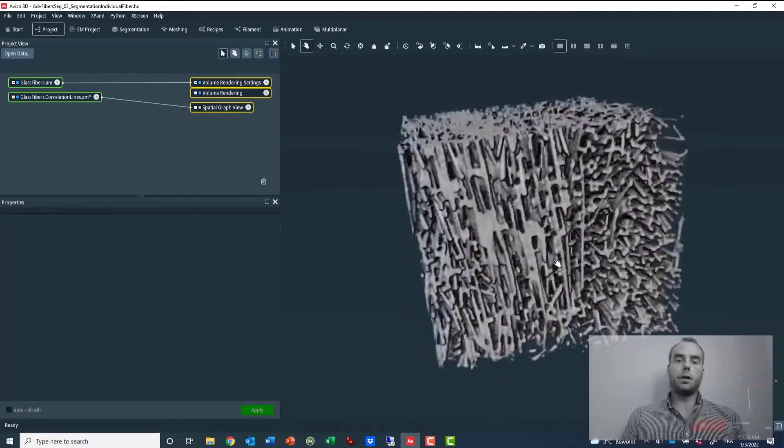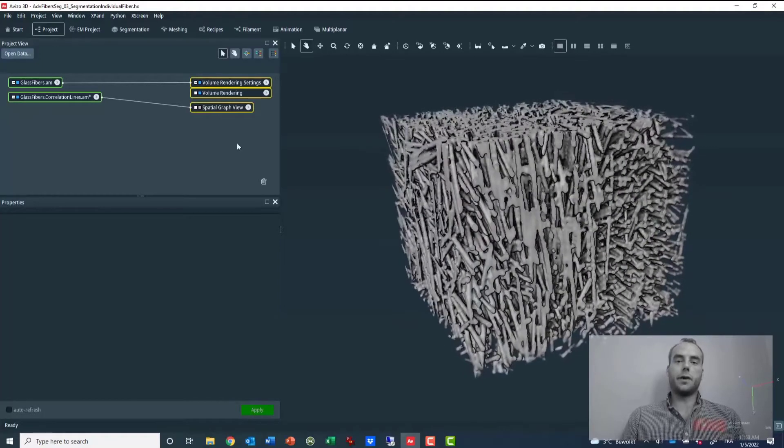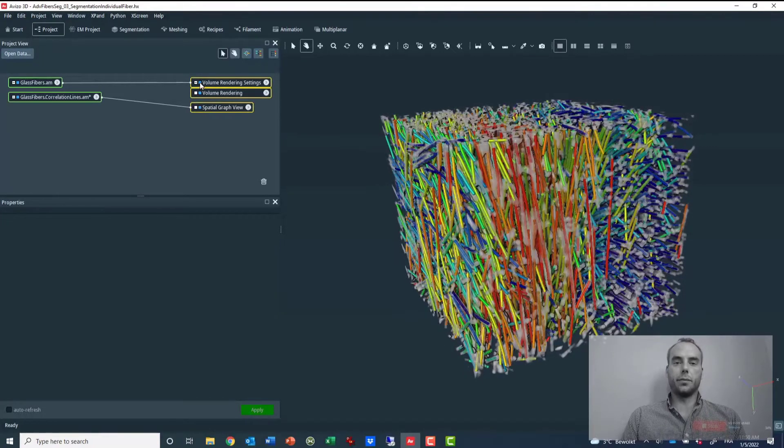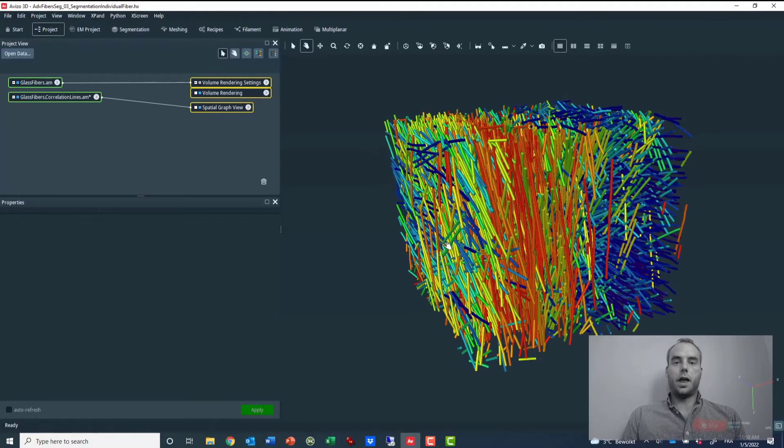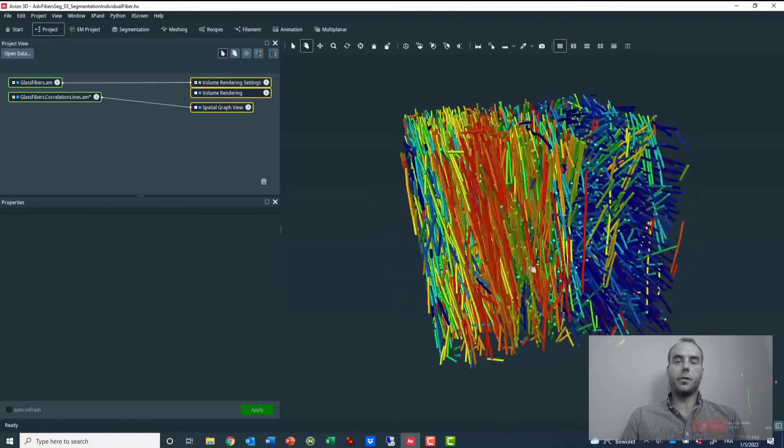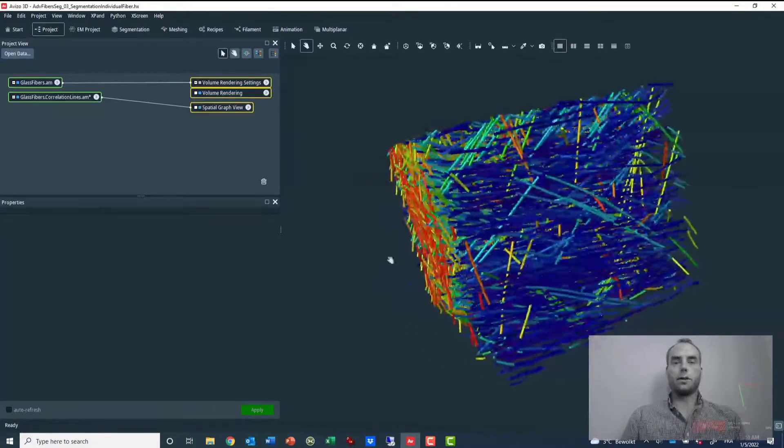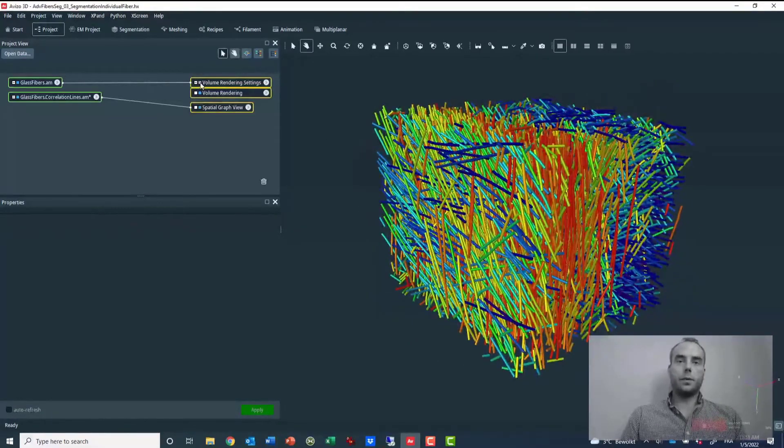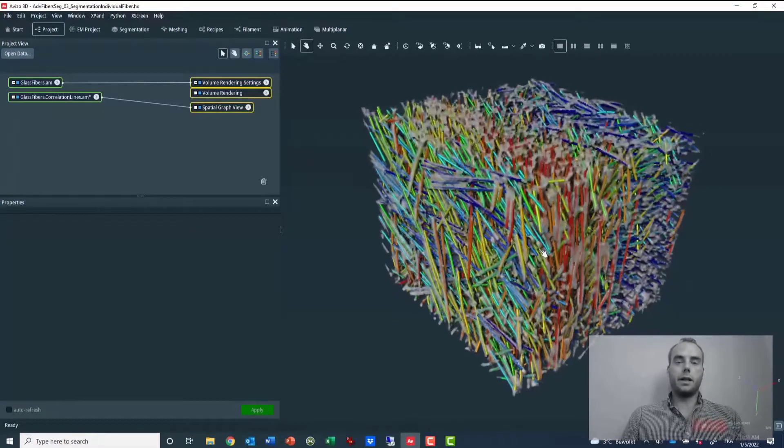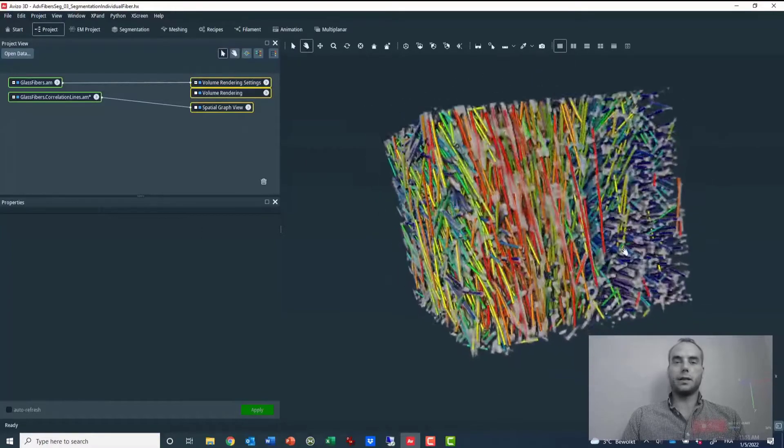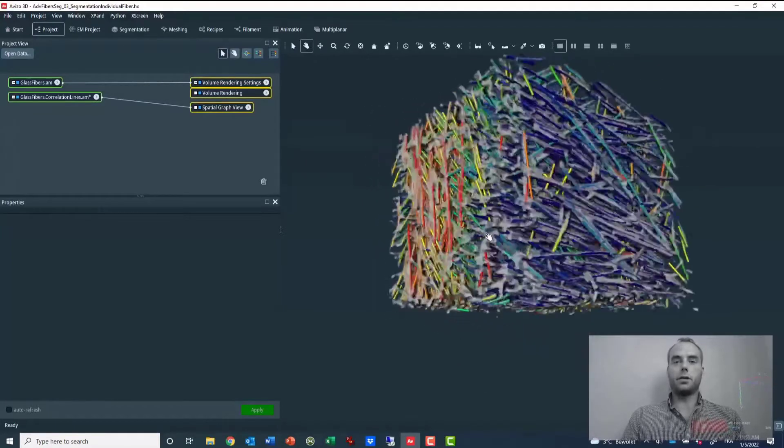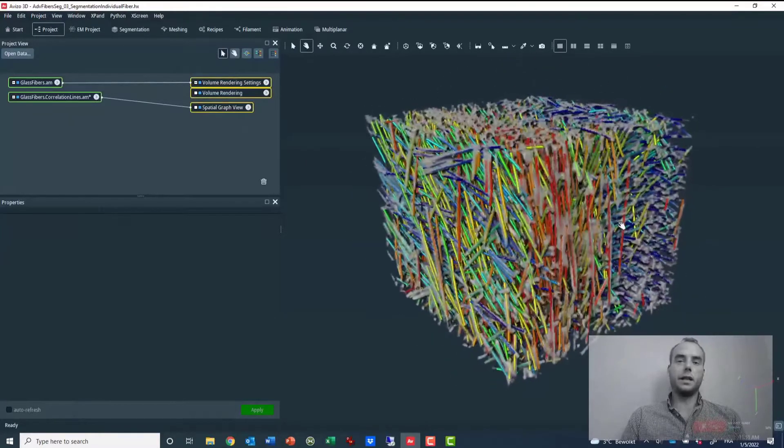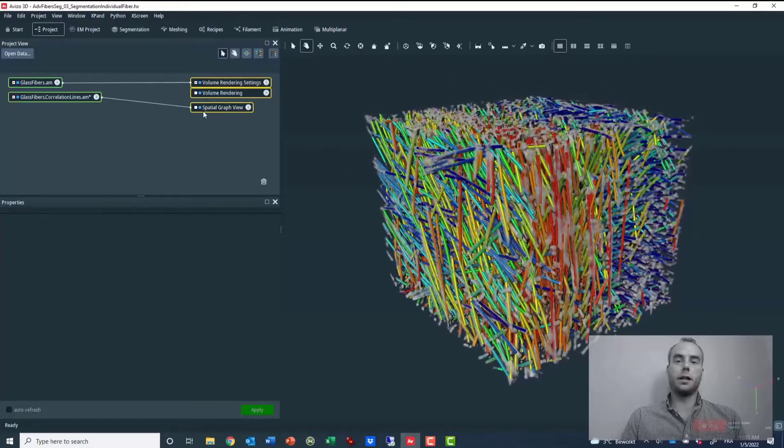So for that I will use this glass fiber reinforced plastic as an example. And these are the reconstructed fibers out of it. But if I display both of them at the same time, you can see that it's not very efficient to evaluate the quality and the accuracy of the fiber reconstruction.